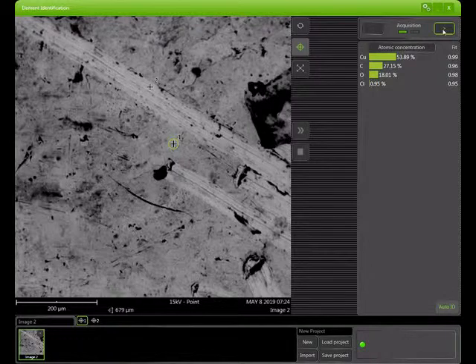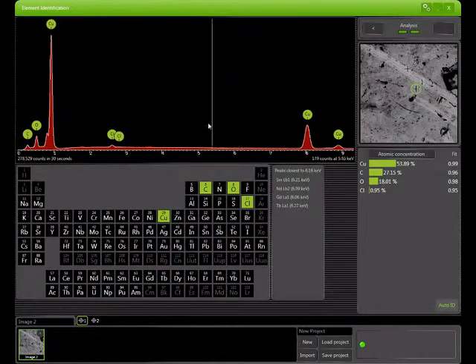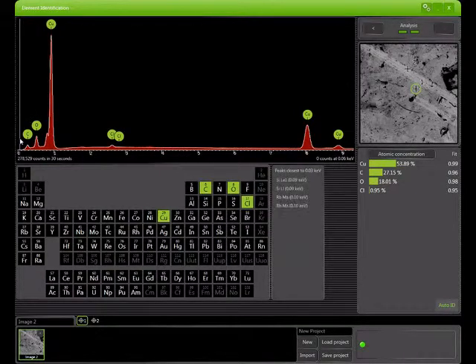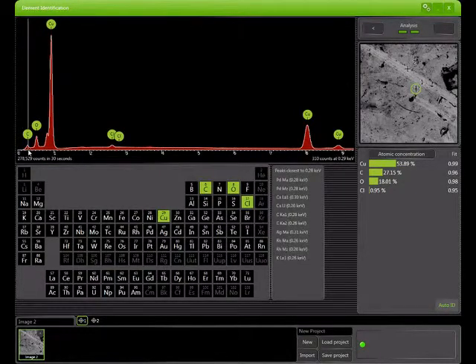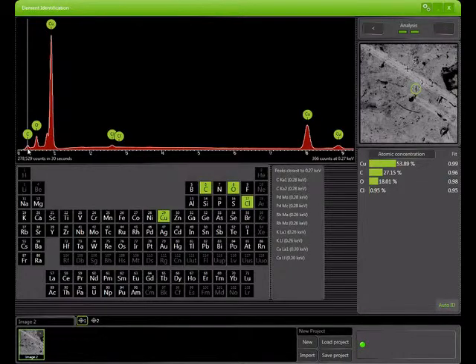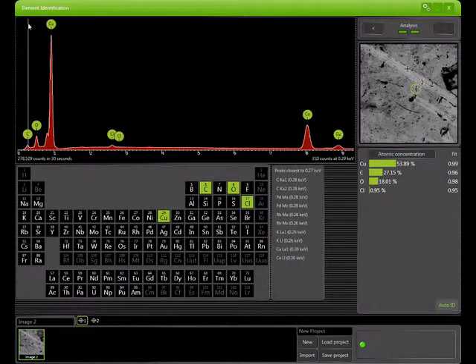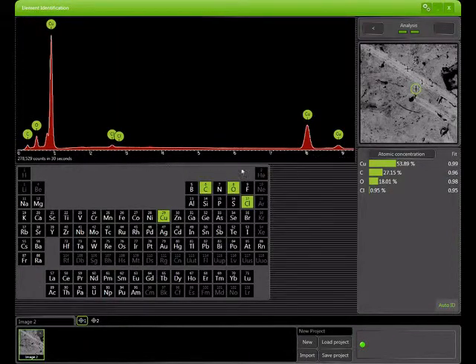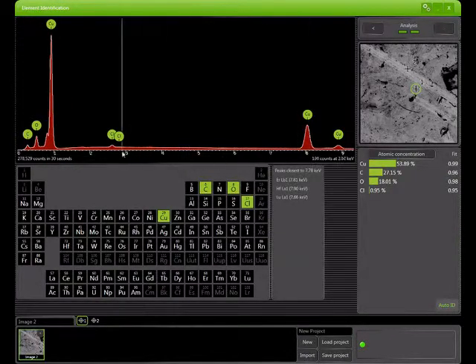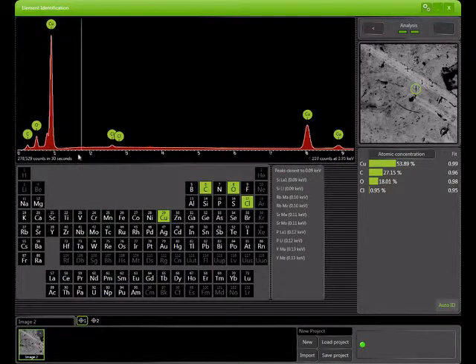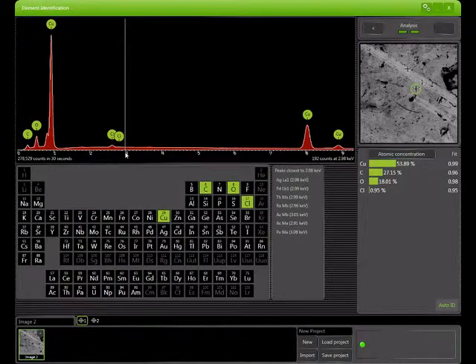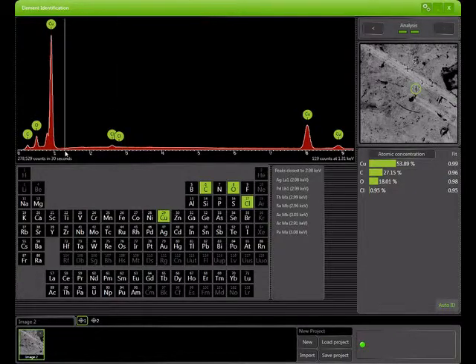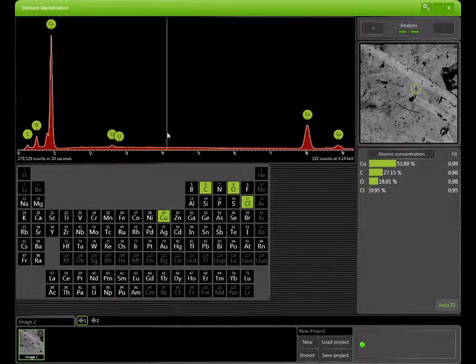We're going to switch from this view to one that shows you what's coming into the spectrometer. This is a histogram, meaning we've indicated on the y-axis, up and down, how many inputs occurred, in this case how many x-rays came into the detector that had a particular energy, a particular place here on the x-axis. This scale is an energy. You read it as one, two, three thousand electron volts.